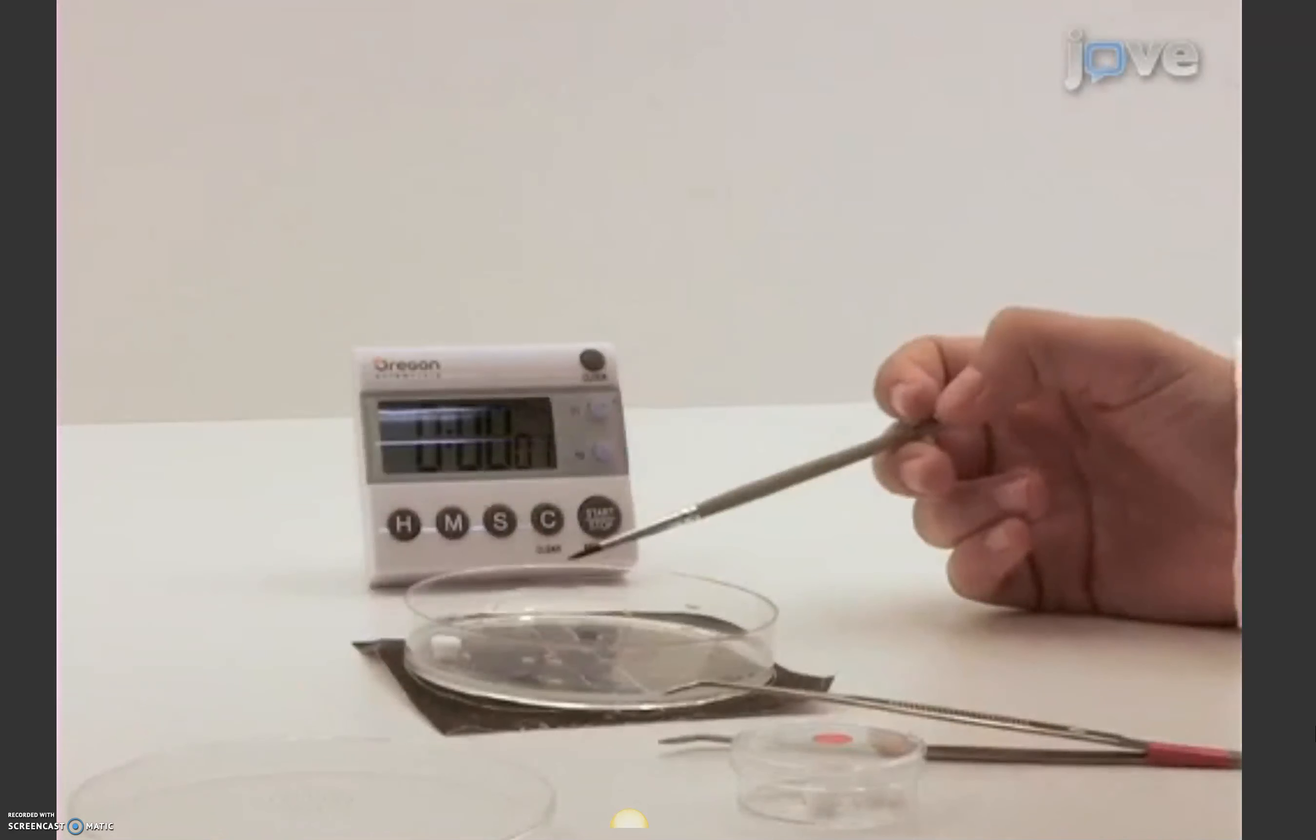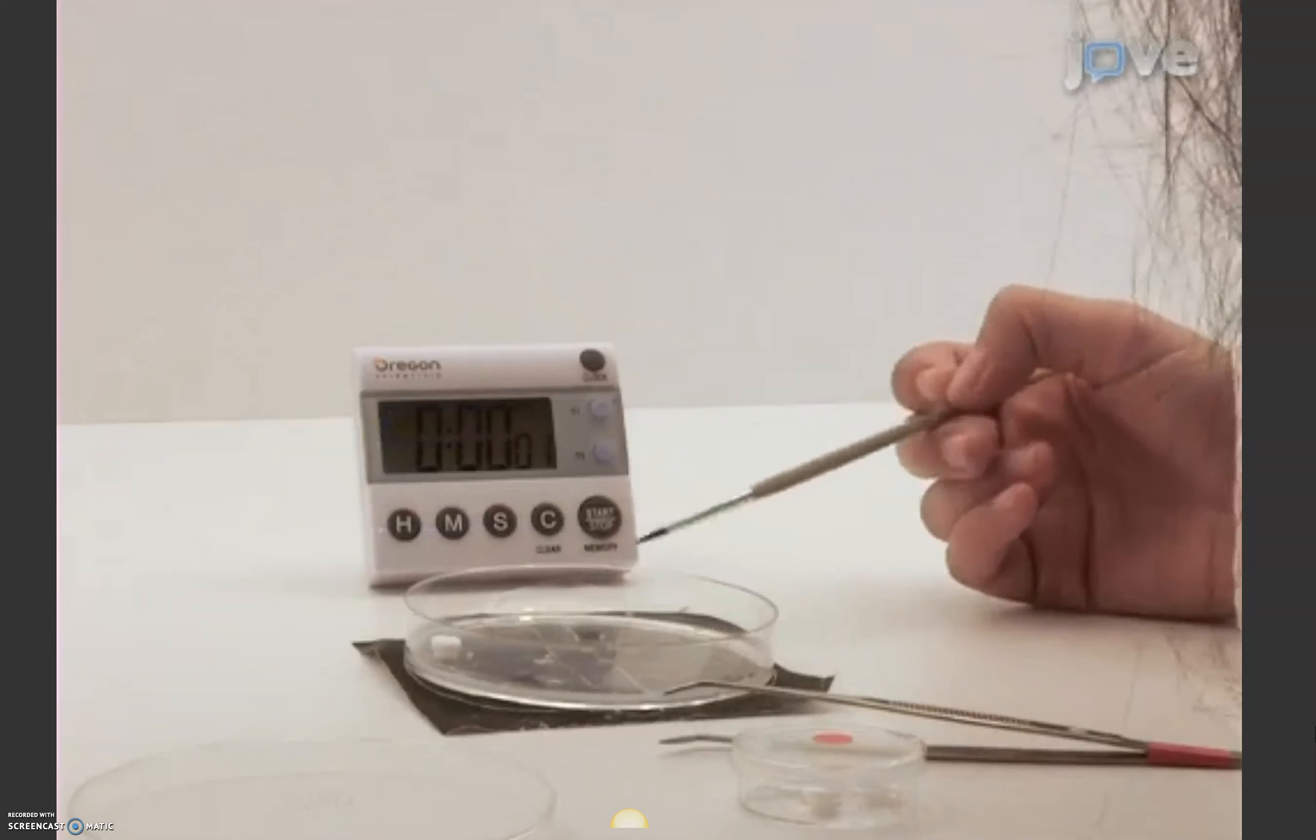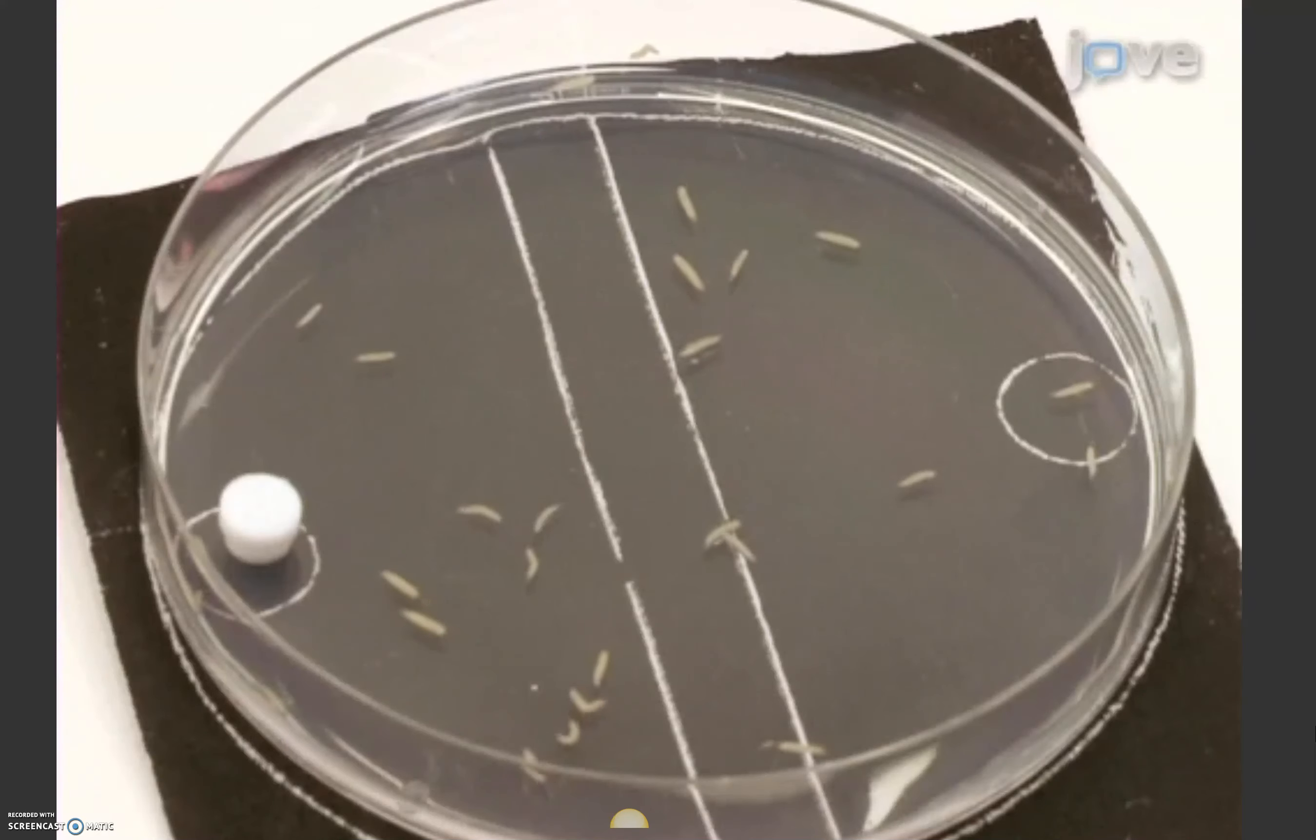Subsequently, using a template, count the number of larvae on the near side, in the middle and on the far side of the dish relative to the stimuli. Perform this test for each stimulus used in the experiment.